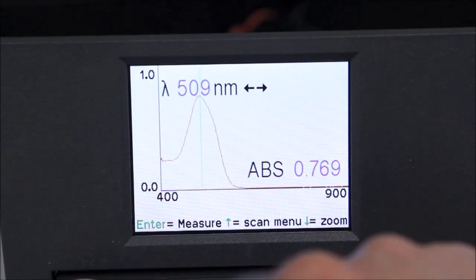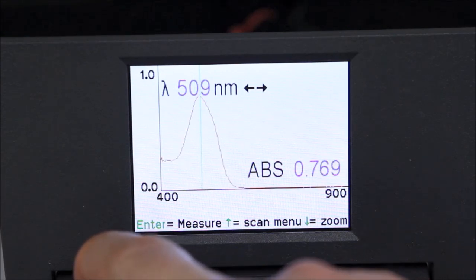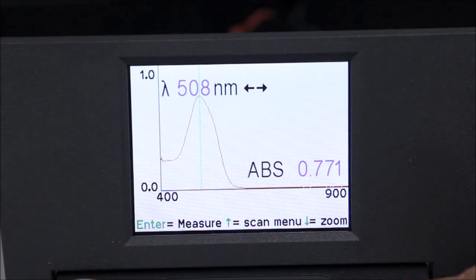We are usually most interested in the wavelength of highest absorbance, which is known as the analytical wavelength, which is approximately 508 nanometers for this solution.